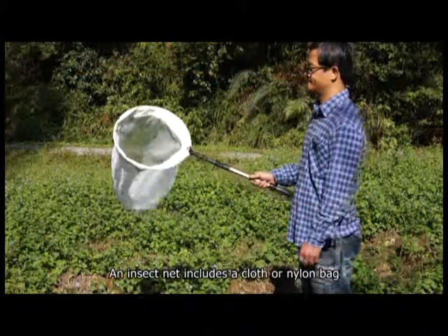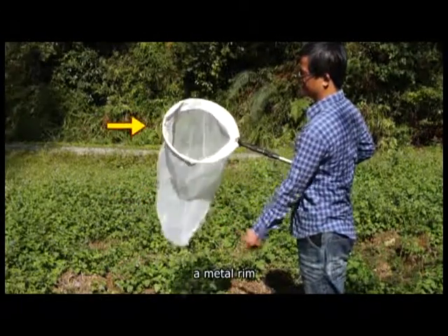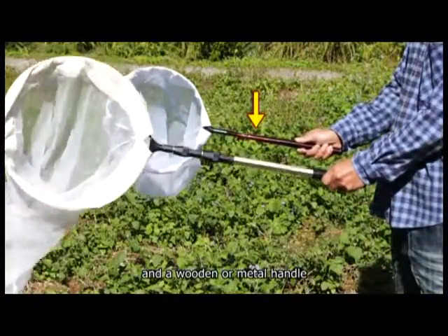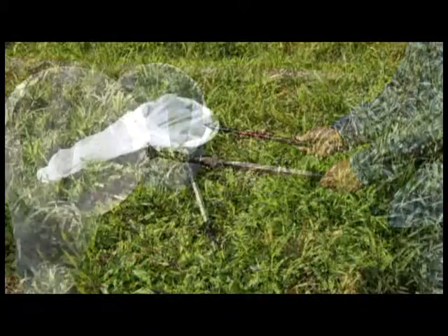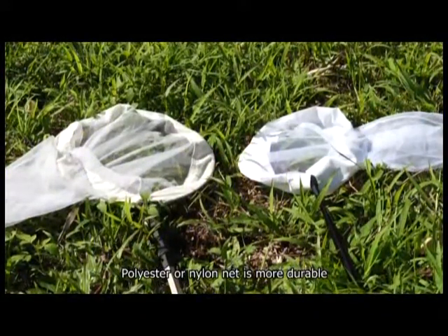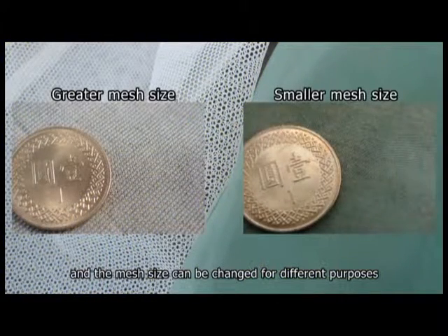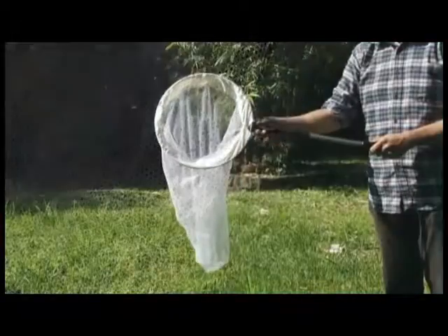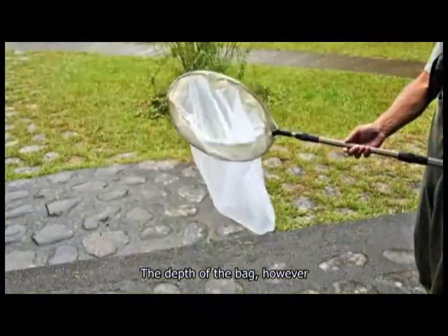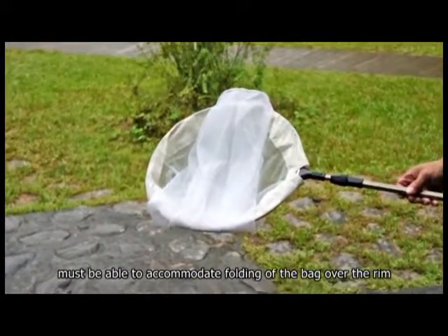An insect net includes a cloth or nylon bag, a metal rim, and a wooden or metal handle. Bag and rim sizes vary. Polyester or nylon net is more durable, and the mesh size can be changed for different purposes. Handle lengths can vary to suit different needs. The depth of the bag must be able to accommodate folding of the bag over the rim.